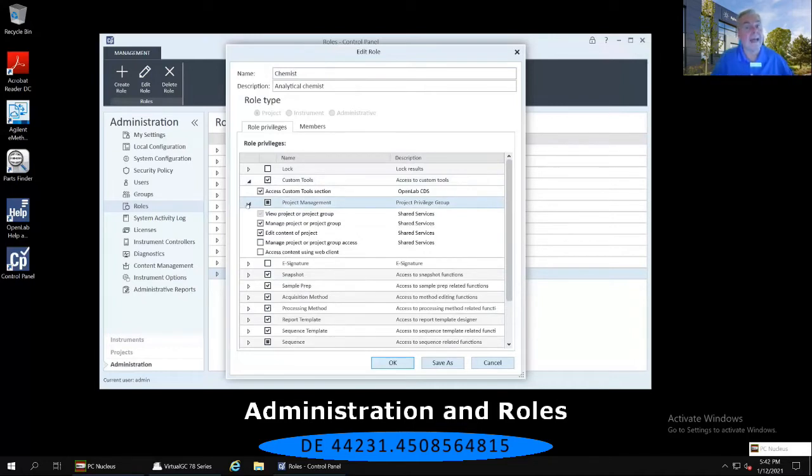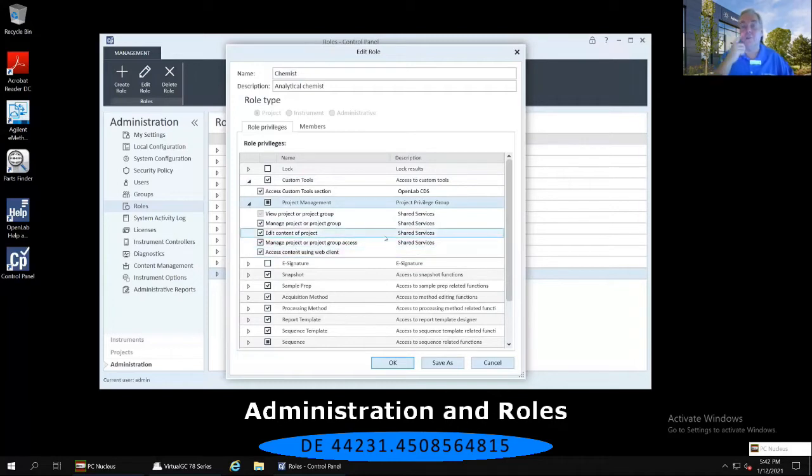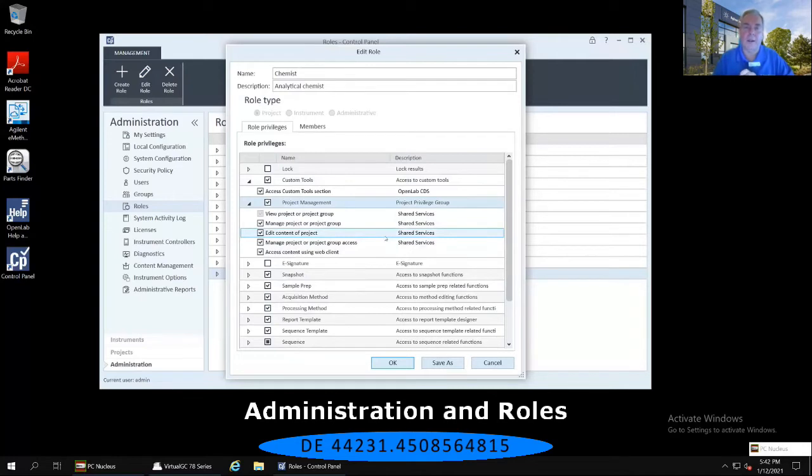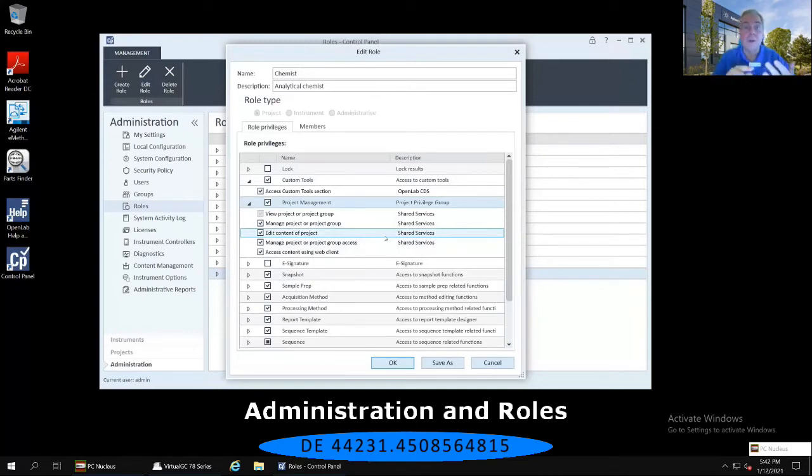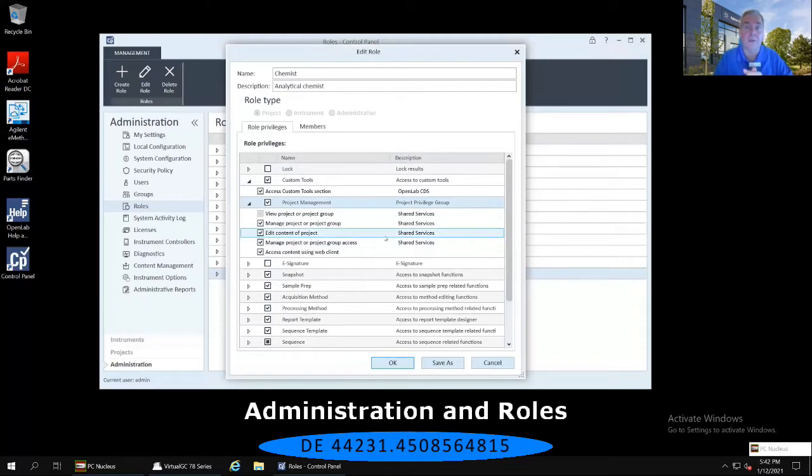Now, if I would like to edit that and give this chemist or another role different access, then I can also select the Manage Project or Project Group Access and select the access content using the web client. Now, one of the privileges I am often asked, more than any of the other ones, especially by lab managers, is there a way to prevent chemists in my laboratory from doing a manual integration of a peak? They have already been trained in their compliant environment that they should not be doing any type of manual integrations at all. It's in their SOPs, but is there a systemic way, a software way, to make sure they cannot do a manual integration on their data? The answer to that question is yes, there is.